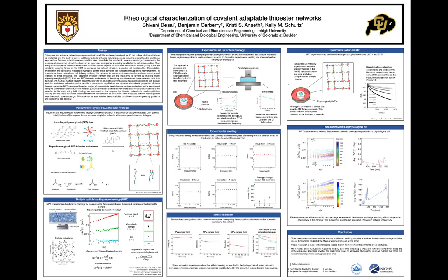Frequency sweep experiments show that the material reaches equilibrium swelling modulus within 1 hour, while stress relaxation experiments show that these materials have tunable stress relaxation properties. And as we increase the excess thiol in the network, the stress relaxation rate increases.